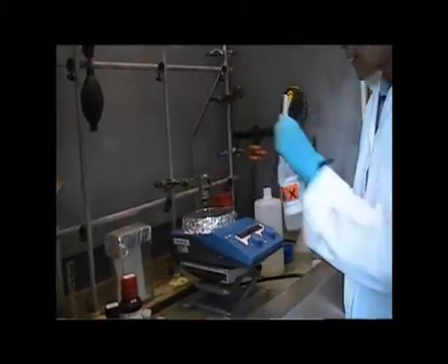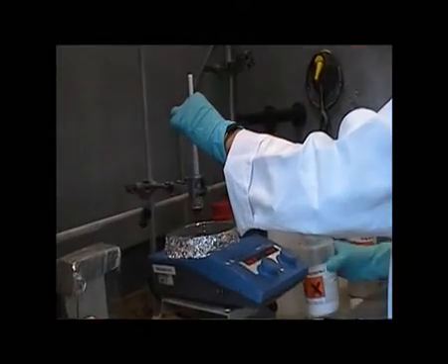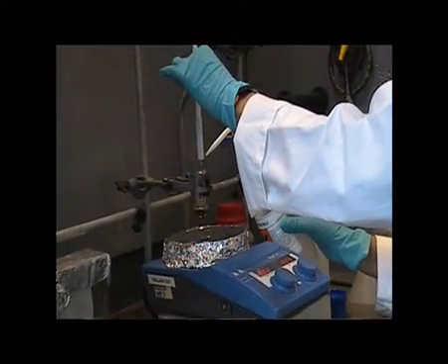Before doing this, we remove the stirrer bar, carefully washing any traces of azide into the flask.